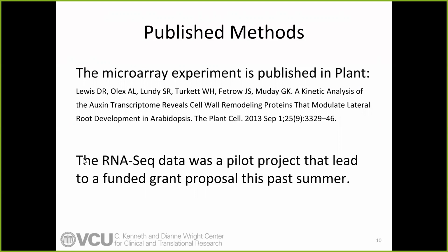Ideally, wouldn't you want it at the start? I would assume yes, but it all depends on what is actually physically possible for that particular region of the genome. And I know in plant biology they have methods that are well vetted and everybody uses them, and this was just a surprising side effect, I guess. An example of that.